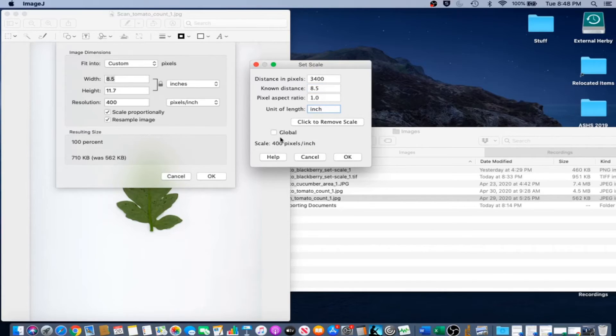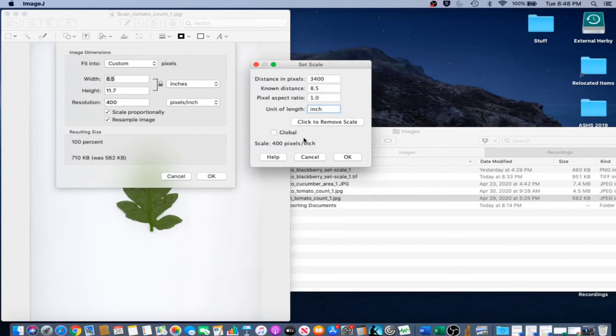You can do whatever you want with global. If you have a whole set of images that are the same scale, go ahead and check it. If not, just click OK.